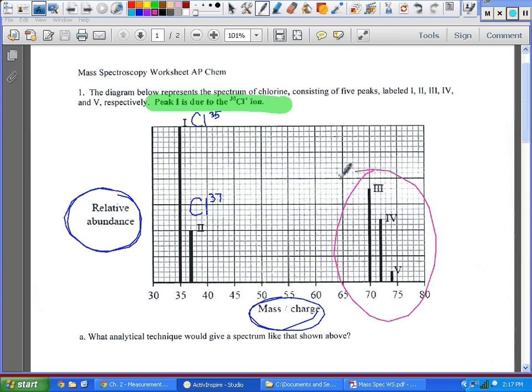This was all red at one time. So if I send one shot through, one shot got 35, one shot got 37, then 70, then 70 something, then 74. Where did that come from? They react differently to the magnetic field.